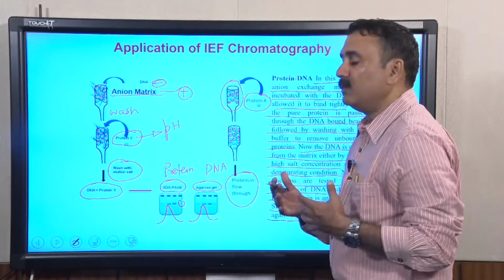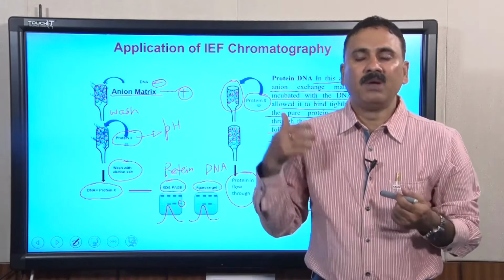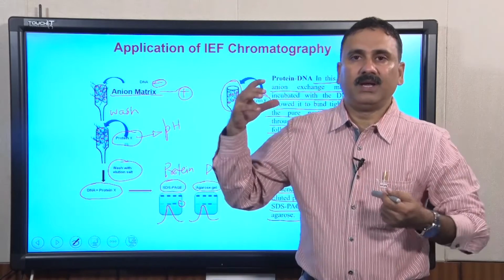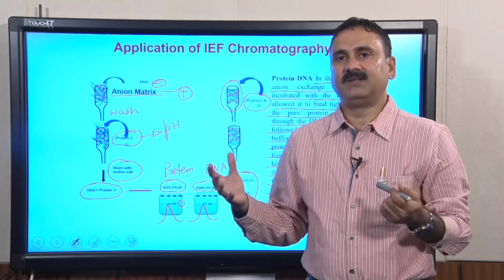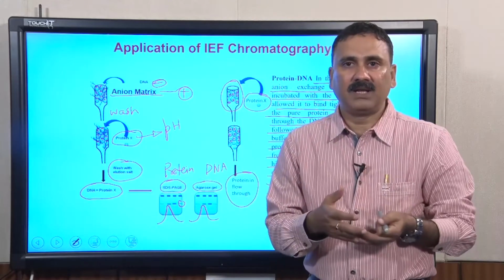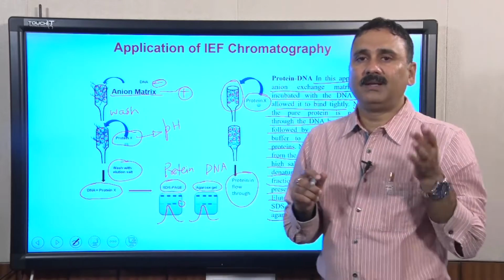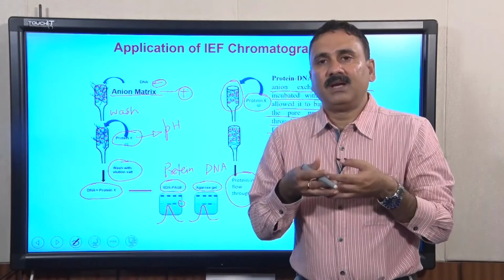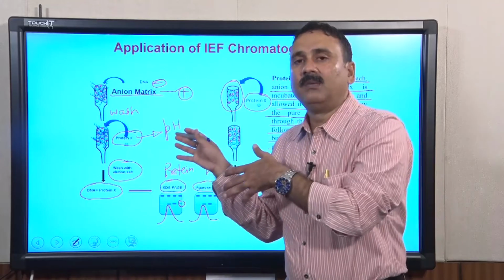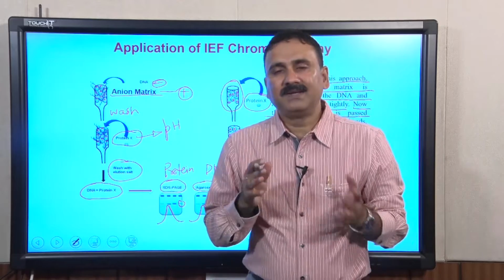When you do this experiment, it will say protein X is interacting with the DNA, but to verify this you can do control experiments, such as adding the protein and its mutants, or performing similar experiments at a different pH, because you know that DNA and proteins interact through electrostatic interaction. So, if you change the pH, the pattern may vary.